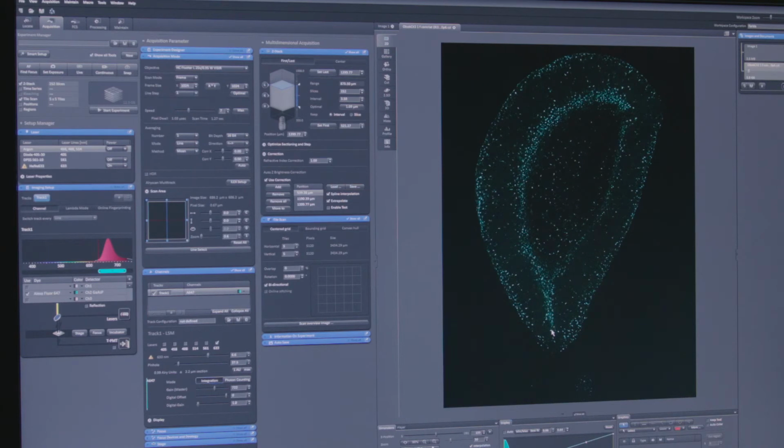You can do morphological studies, check the size of your organ, turn it around to see if there are differences with disease conditions, and of course you can look in 3D at the architecture of your cells, and the distribution, and then quantification, analysis, counting. That's wonderful. Yeah. Perfect. Thank you very much.